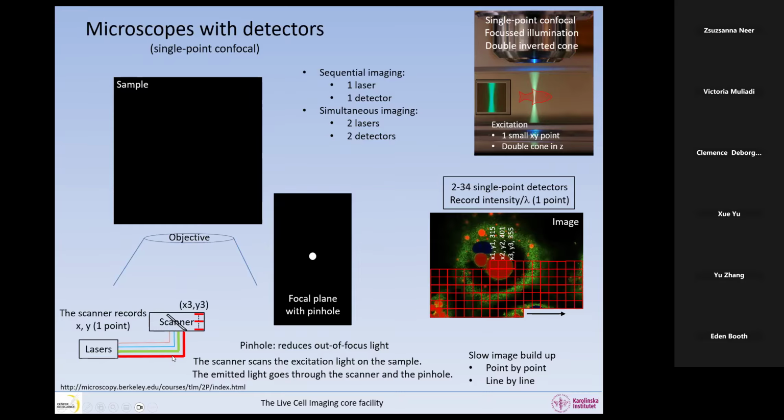Now we're adding a new laser to our system. Both the green laser and the red laser are on. So what is the color of fluorophores that are excited by red light? Anyone? Infrared, I guess. Far red.